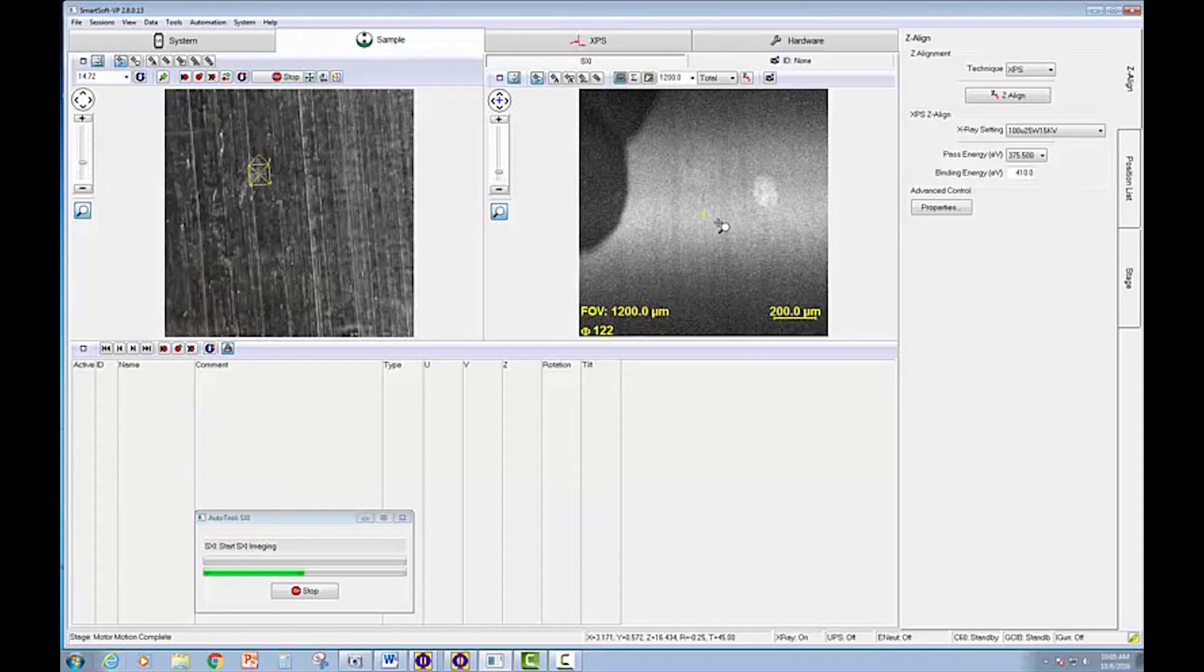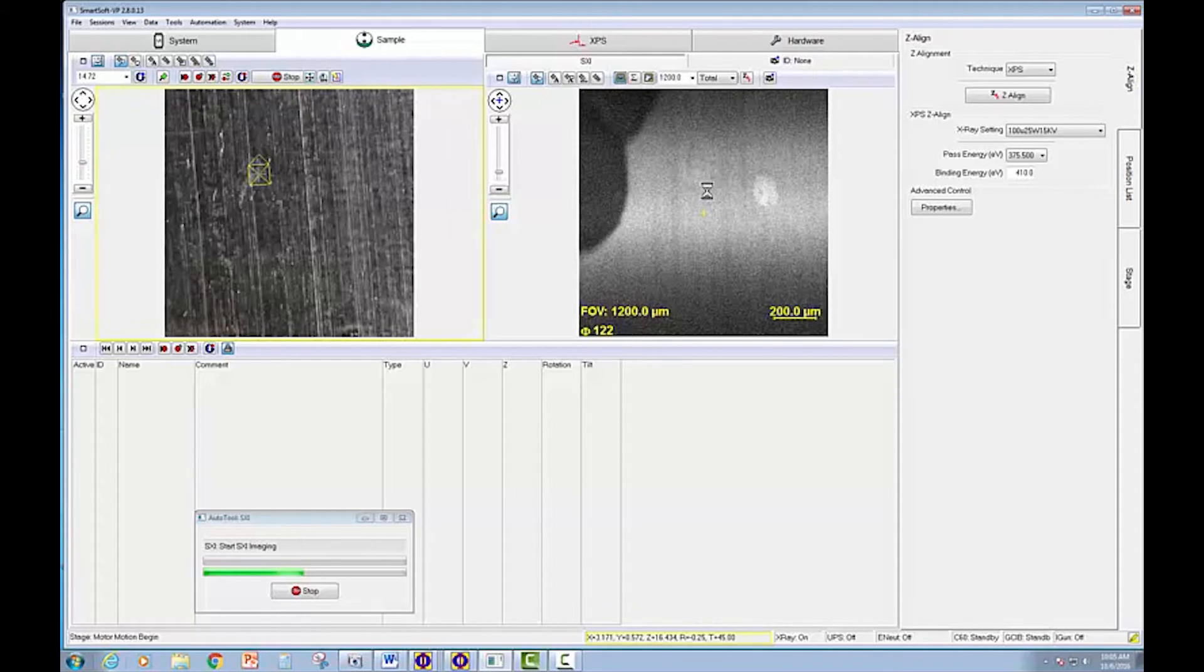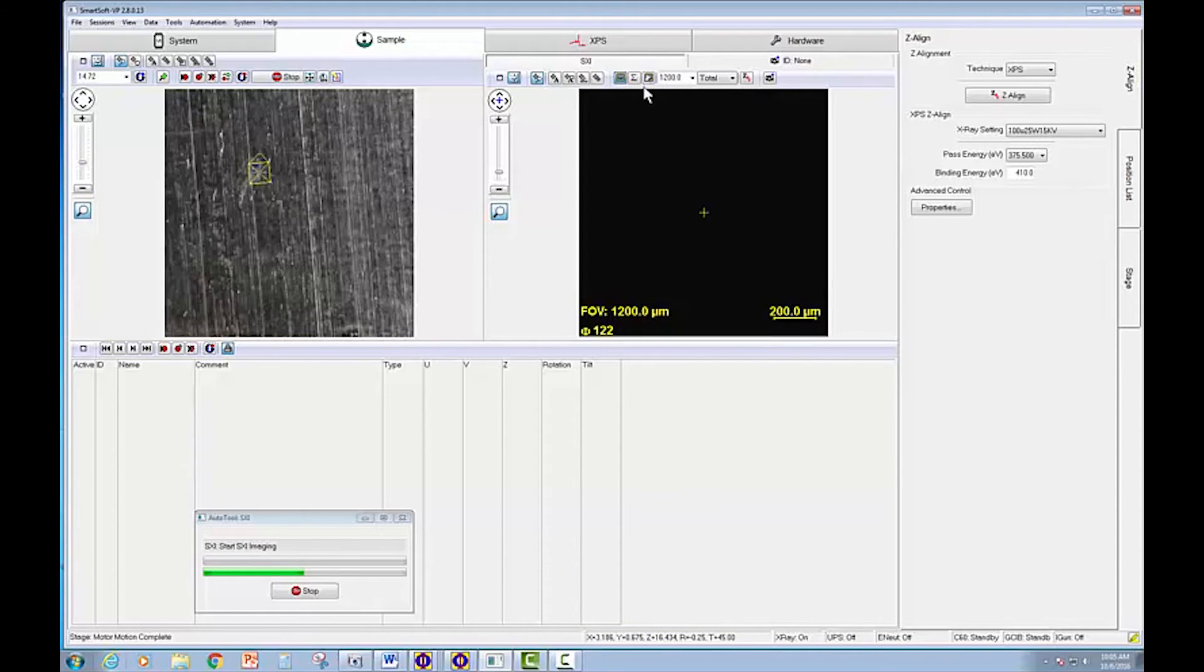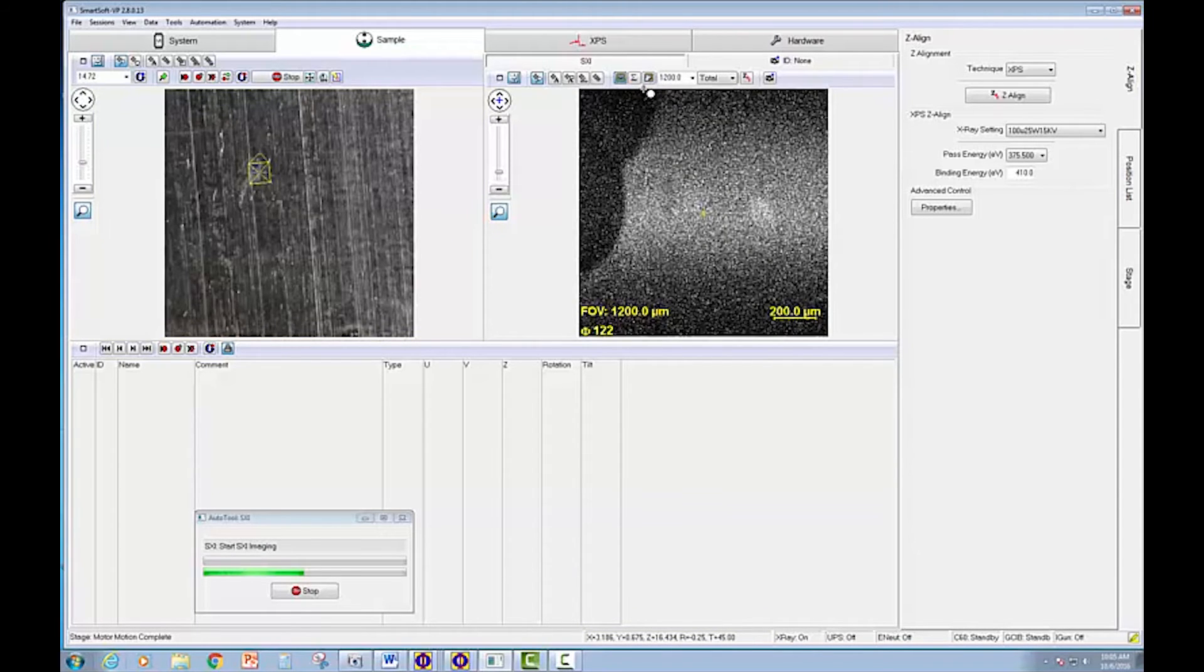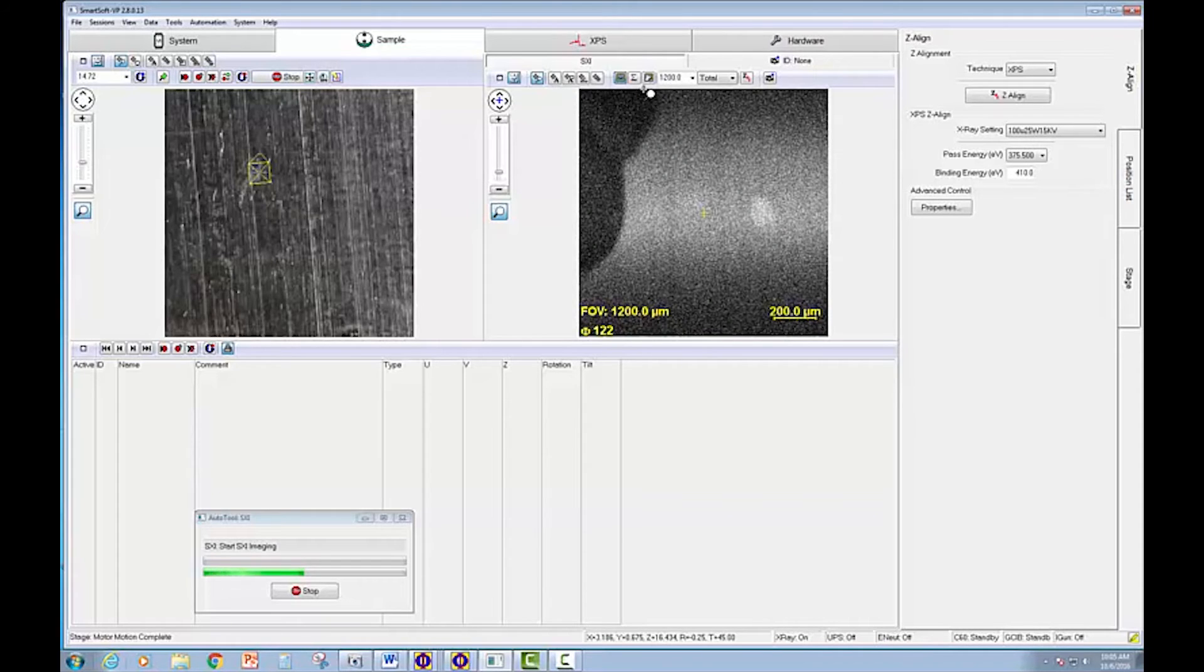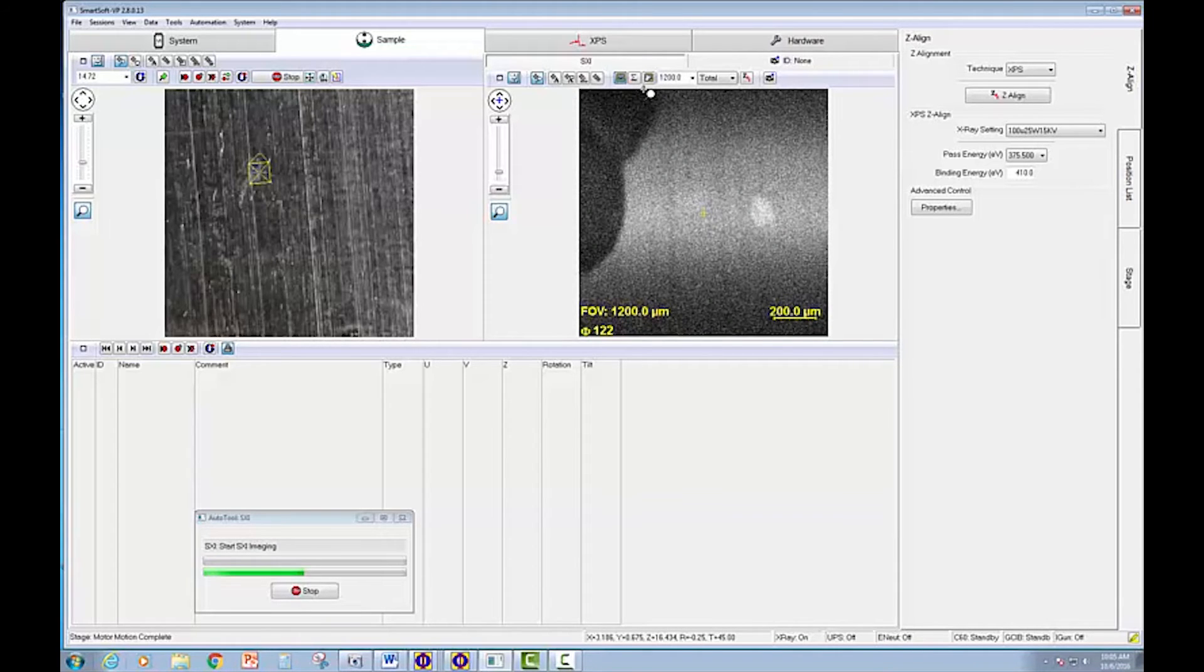So I'm just going to center that region. I'm just going to click here and refresh the image again. And then we'll perform an analysis on those three different locations and see what the compositions are.